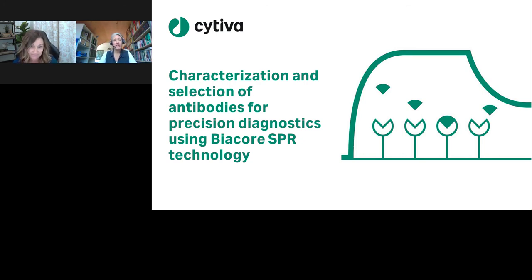Oh, thanks for this question. Yeah, this is really interesting, and we have the possibility. Similar to what I showed in the presentation, where they measured binding under different pH and salt concentration just by changing the running buffer, we also have an opportunity in our Biacore 8K systems and also in Biacore S200 to test a lot of different conditions for the binding itself.